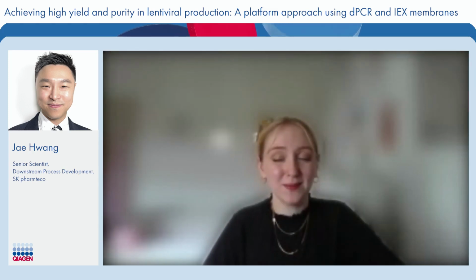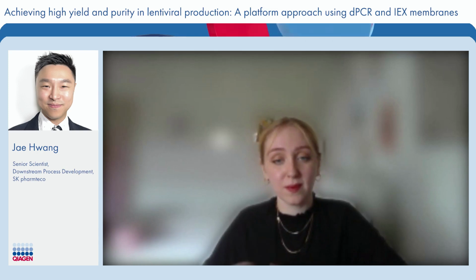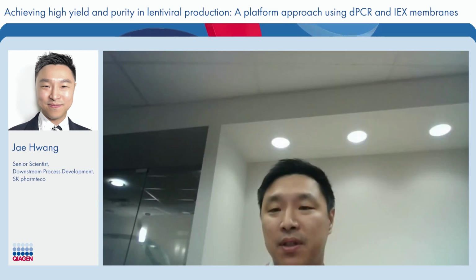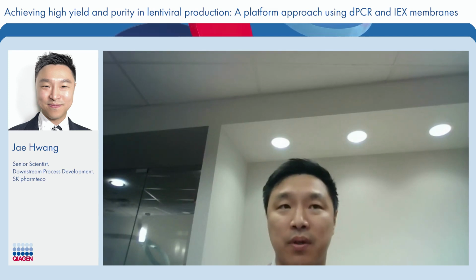Wonderful, thank you so much. And what is the maximum shear rate, and what is the range of TMP? Maximum shear rate and TMP, and the shear rate really depends on how we perform.